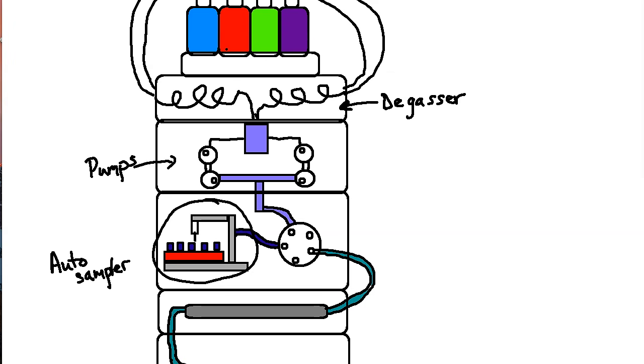It's usually a tiny amount, like 50 to 100 microliters. And that will send this material right into the injection port, where it will also meet up with the mobile phase, and that will be sent down into the column. So that's the next part right here. After everything is thoroughly mixed, it is sent down, and your material from the autosampler is going to adhere to the column, and then your pump is doing its thing.